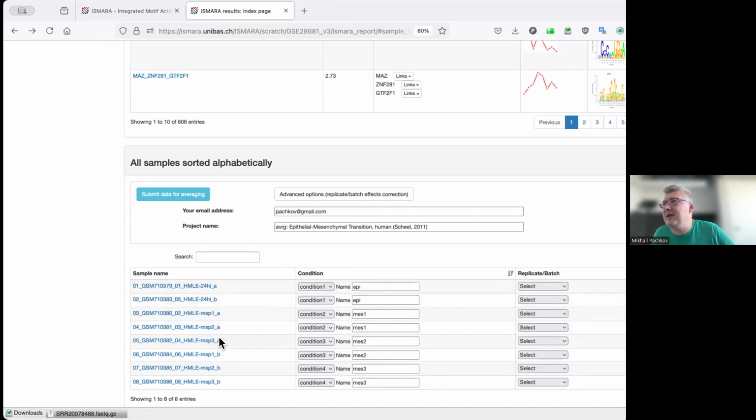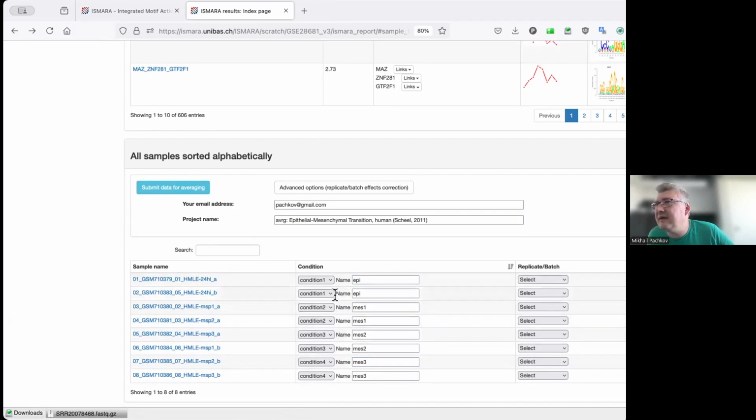So you see A, B, A, B. So this is batch 1, this is batch 2.